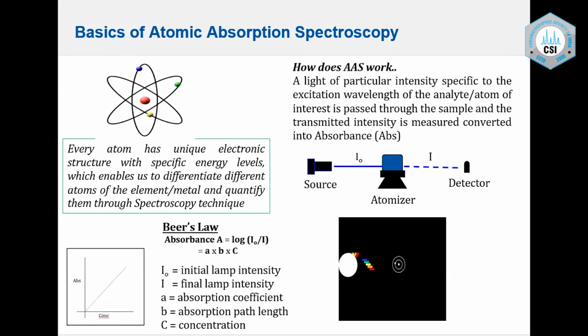Moving to atomic absorption, AAS is based on the absorption principle, and it is based on Beer's law. So here the concentration is proportional to absorbance. The sample should be in liquid form, and the sample solution will be aspirated into a flame using a nebulizer. So the elements get atomized and ground state atoms form here.